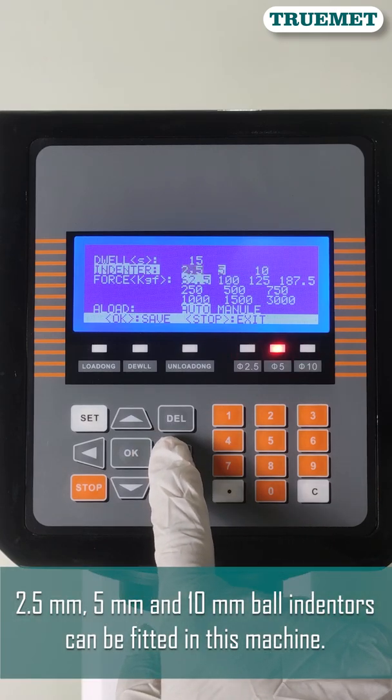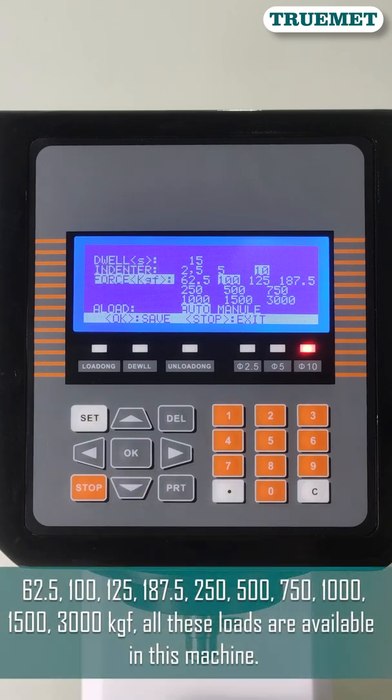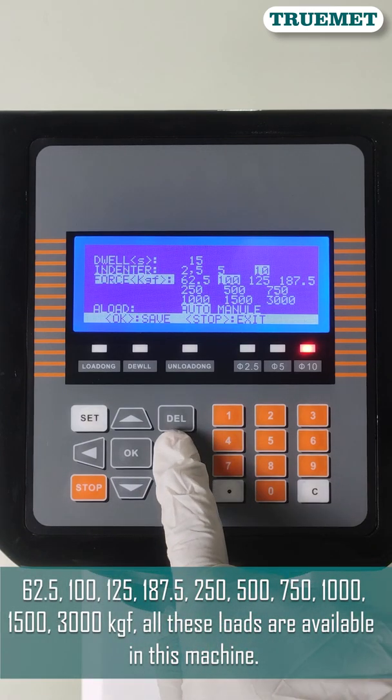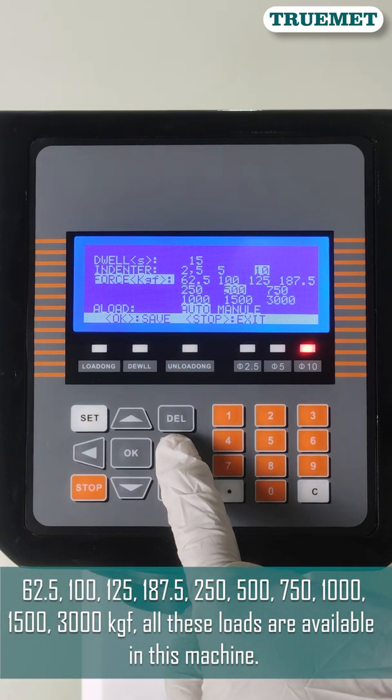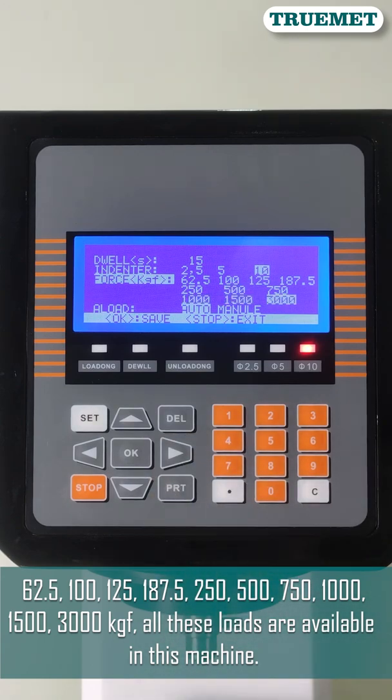2.5mm, 5mm, and 10mm ball indenters can be fitted in this machine. The following loads are available: 62.5, 100, 125, 187.5, 250, 500, 750, 1000, 1500, and 3000 kgf.